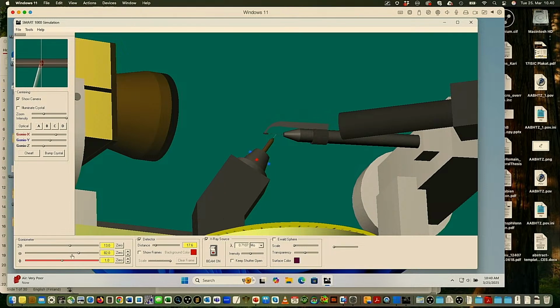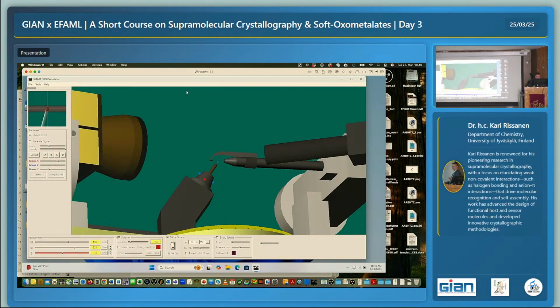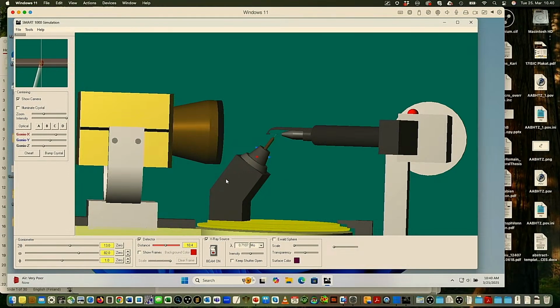So all these things, it always has to remember, whatever we do, it always has to remain there. But okay, now, what is this? Let's put this distance a little bit closer now, and make it like this. And what we now want to see is really whether there is any diffraction.